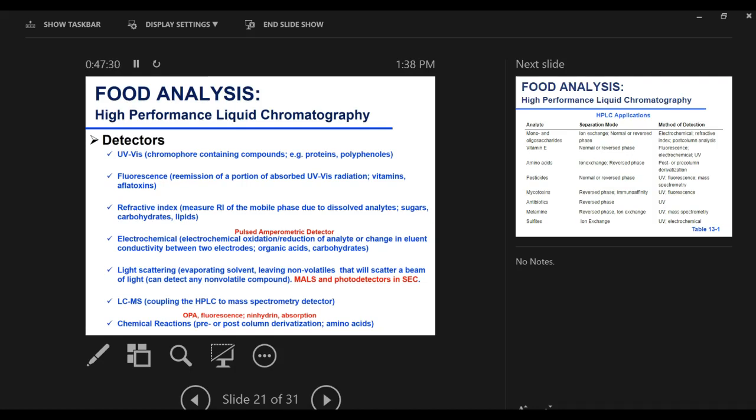So in fluorescence spectroscopy, you would set to absorb at a particular wavelength. So you set the absorption wavelength and also you set the fluorescence wavelength. And also you set those that will give you the highest sensitivity. So you would monitor at two different wavelengths, one for absorption and one for fluorescence. And we'll talk more about that in the spectroscopy lectures.